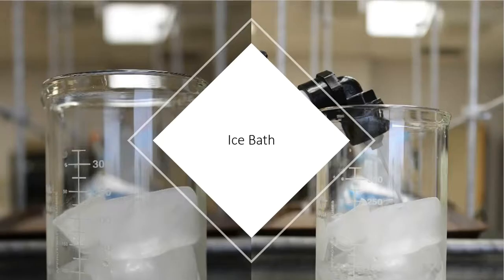All right, so I went to the freezer, took out some ice cubes. That's all it requires. Add some water to it, and away we go. Now, the reason the ice bath is going to be important is because we have to chill things down appropriately.